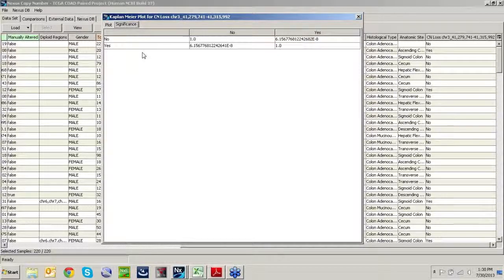have differential survival analysis. All right, so to wrap up, today I showed you how to add annotation to your data set, and also how the addition of survival data can really enrich your overall evaluation. We can use indirect methods to identify significant regions for survival analysis, and this is by identifying a region of interest and then evaluating its survival in the data set tab.